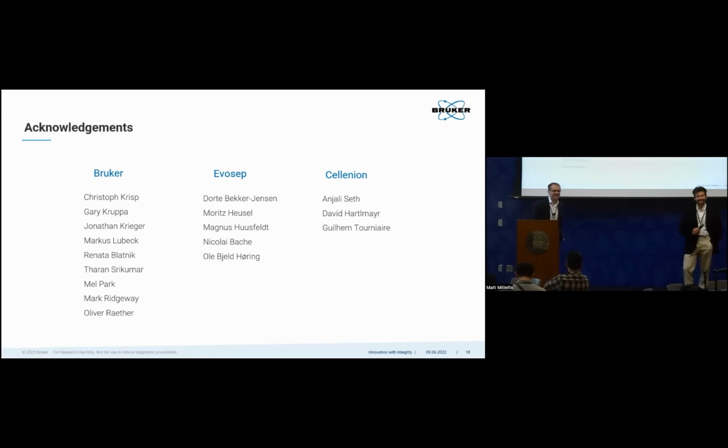Okay. I see a question in the back. Thanks. Fascinating stuff. I have two related questions. One is, when you use this technology, what's the trade-off in terms of ion transfer efficiency? So how many extra ions don't make it through? And the second one, you might have started answering it, is what physically is it that limits the resolution? Is it space charge effects? Is it defocusing? Is it the amount of gas that's pushing on things?